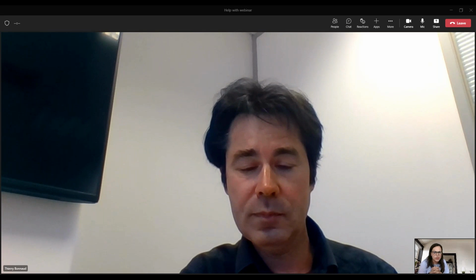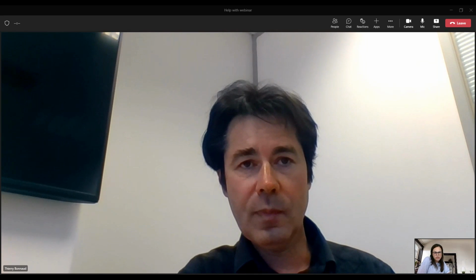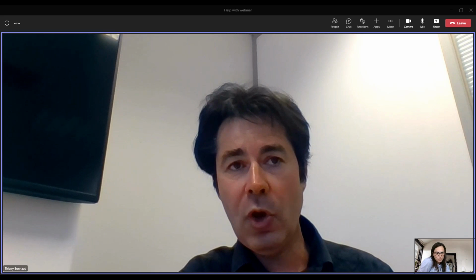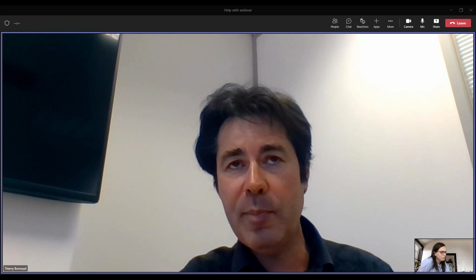Thank you. And we have another question, I think related to the Crystal 16. One of our attendees is asking which method for ramping, the linear or the quadratic, is more precise. I don't think the ramp is related to precision, it's more the technology that is related to precision. I think it's related more to the objective that you have. Yeah, that's right. Typically, we will take a linear ramp because we can control it better and it's nicely reproducible.